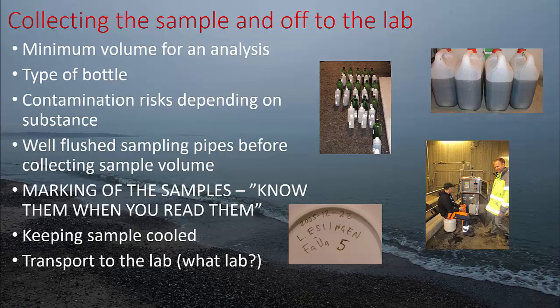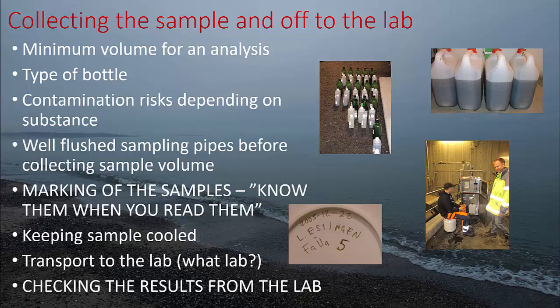And also, to what lab is the sample transported? Today, you can take a sample in one country and the lab will send it to another country for analysis. This could have some impact on the results as well, but you need to be aware of this when you check the results that you receive from the lab.